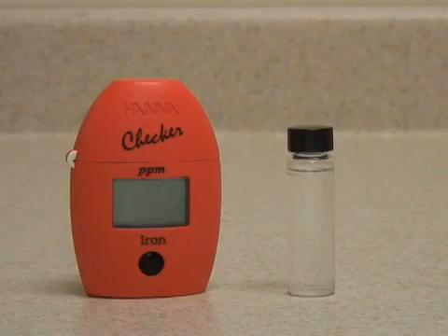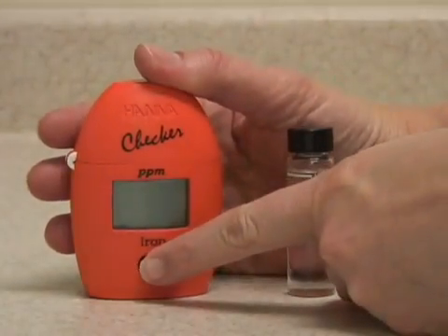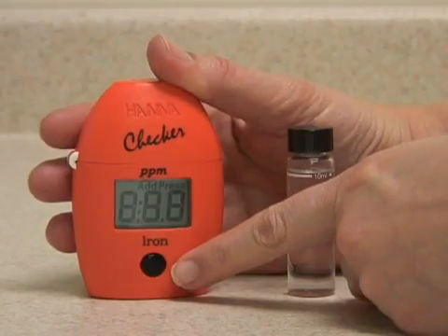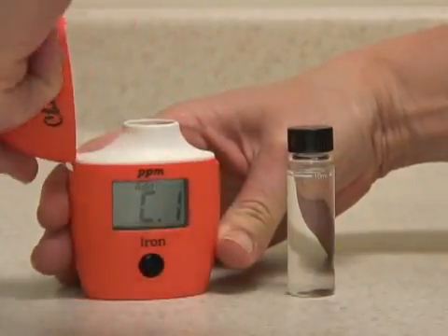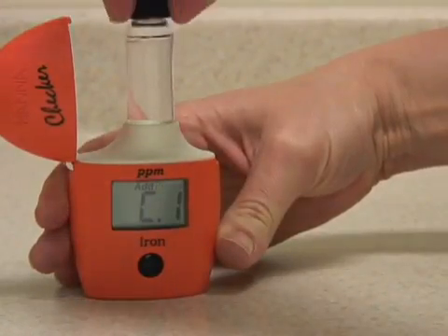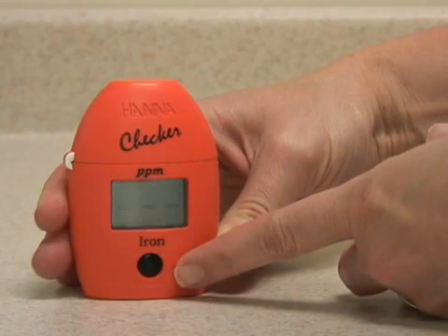This is the Hanna Instruments Checker HC for Iron. Push the button once to turn it on. When the meter displays C1, insert your unreacted sample to be zeroed. Press the button again to zero the instrument.